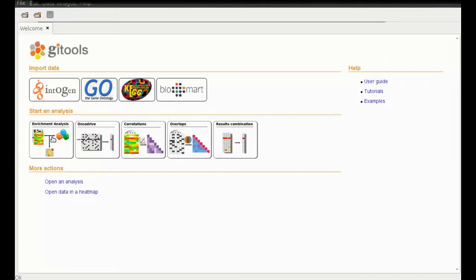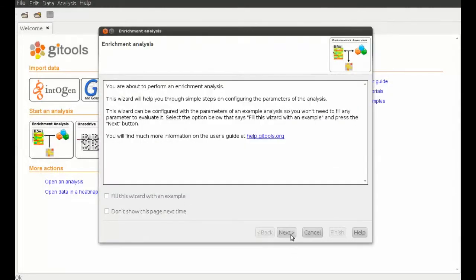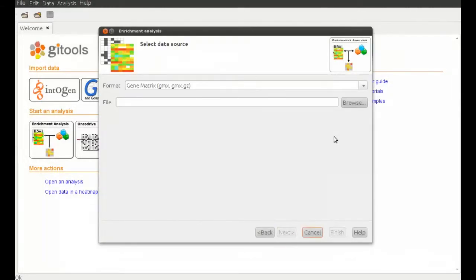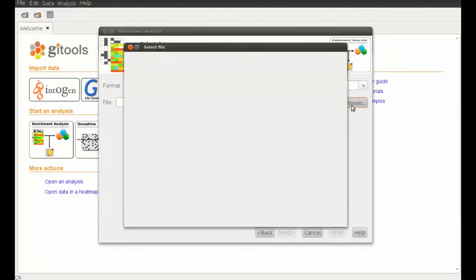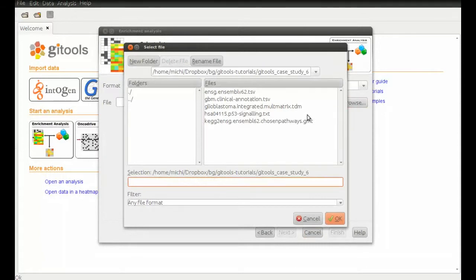Once we have GI tools open and running, we will click the enrichment analysis button in the welcome tab, and a new wizard will open that guides us through the analysis.